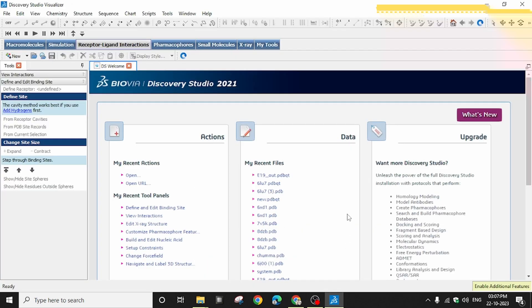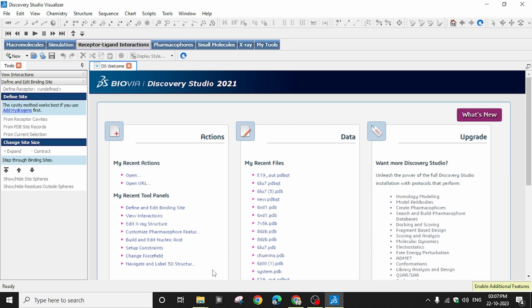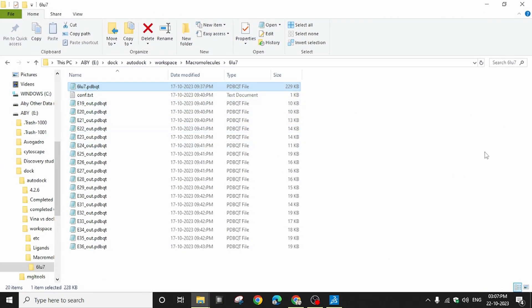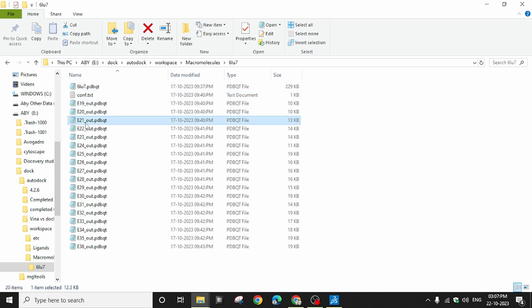For that we'll be using Discovery Studio Biovia today. It's a good tool and very useful in molecular visualization and also for docking validation and result analysis. I have already completed my docking using AutoDock Vina. The 6LU7 is the SARS-CoV-2 main protease enzyme used as my protein, and these are some of the drugs I constructed using Marvin Sketch and optimized using Avogadro. We'll be discussing docking validity, result analysis, and how to identify interactions between the protein and ligand.